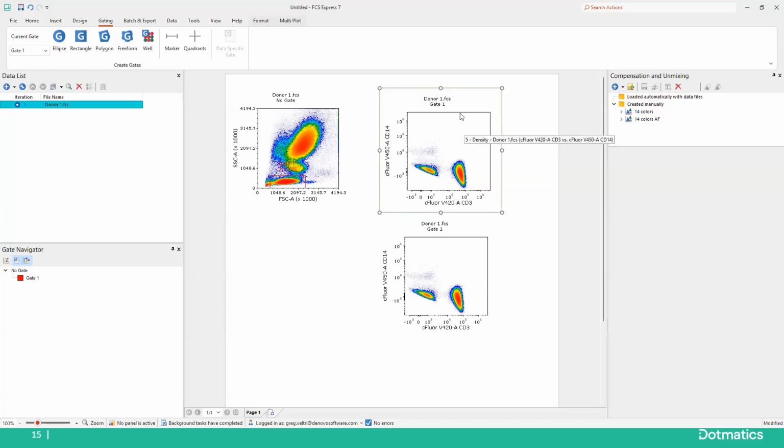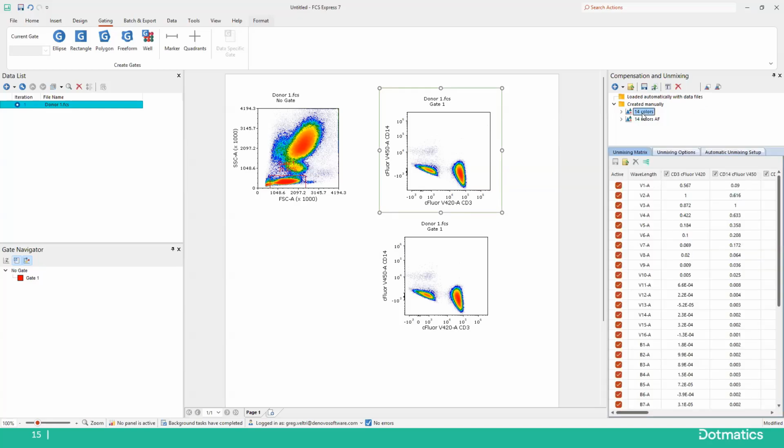All right. So what I can do is select the plot, and go to the matrix here, and go apply to the selected plot and apply it that way. And then I can also go here and apply it to all the plots. Right. So I have one way of doing it that way.